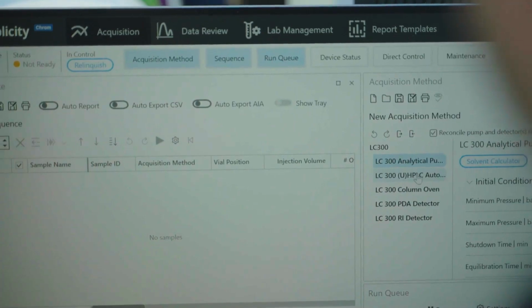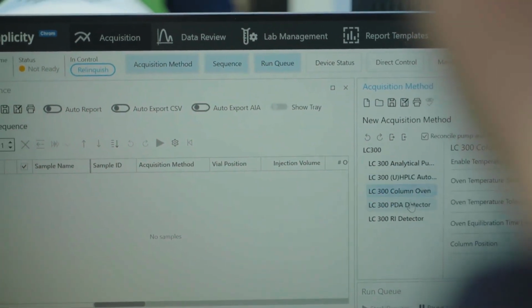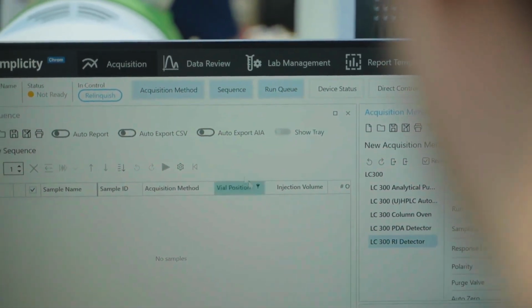But ultimately, the chromatography data systems are used to produce final product certification in quality control labs. So over time, the reporting capabilities of a chromatography data system have evolved to accommodate the needs of specific companies, so customization of the reporting capability has become very important.